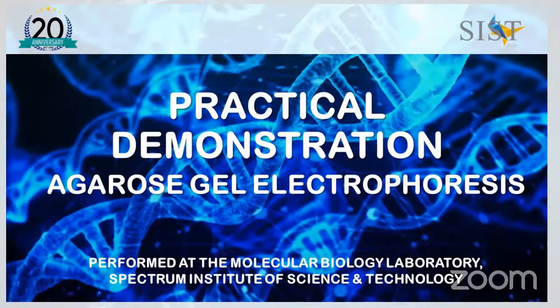So now we can go to the demonstrative video we have done in our Spectrum Institute of Science and Technology. Agarose Gel Electrophoresis. Okay, let's start.